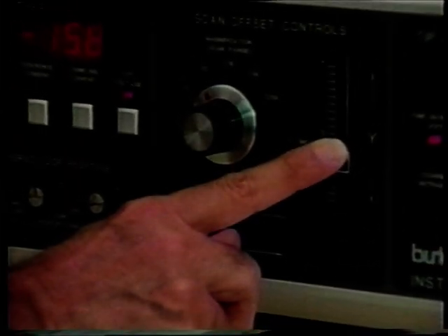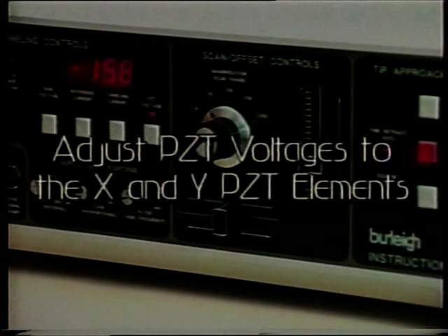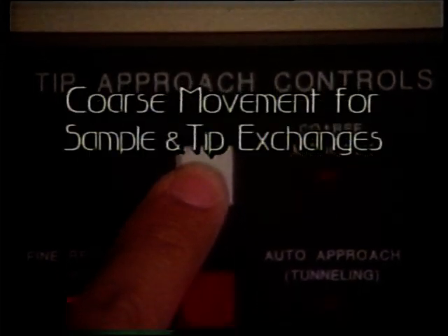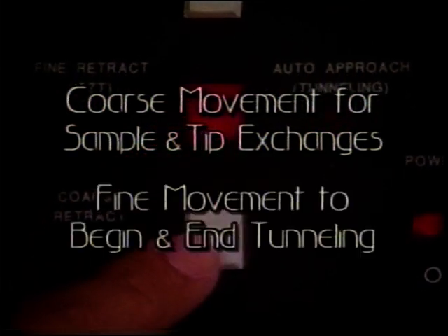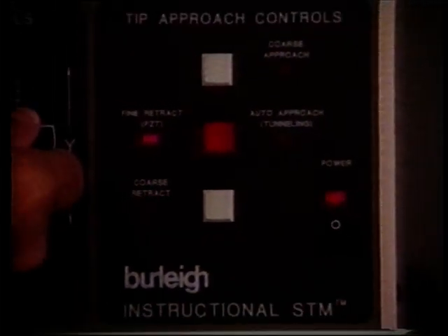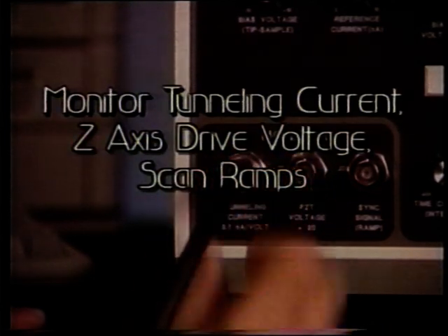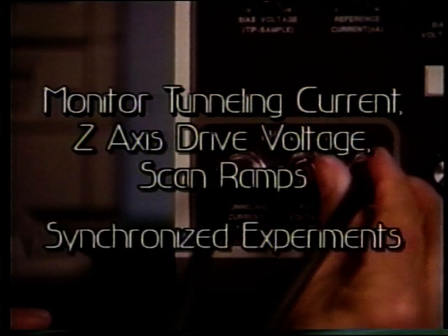Scan and offset controls adjust PZT voltages to the X and Y PZT elements for imaging different size areas or different locations on your sample. Tip approach controls allow selection of coarse movement of the probe tip for easy sample and tip exchanges, as well as fine movement to begin or end tunneling. These controls ensure a crashless automatic tip approach to tunneling. The monitor outputs allow tunneling current, Z-axis drive voltage, and scan ramps to be monitored with an oscilloscope or used for synchronized experiments.